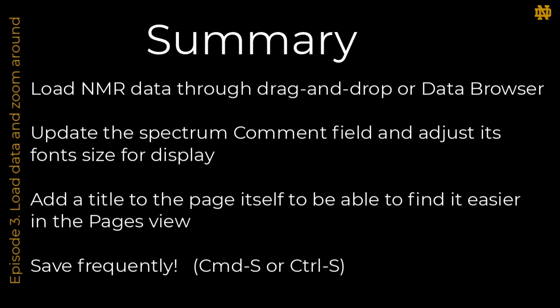In summary, in this episode, I covered how to load NMR data. I suggest you update the spectrum comment field and adjust its font size for display with the data. I also suggest you add a title to the page itself to be able to find it easier in the page's view of the document. I urge you to save your work frequently. Use Command S on Mac or Ctrl S on Windows.